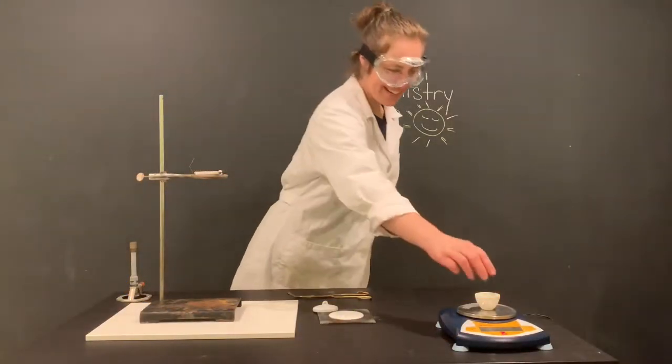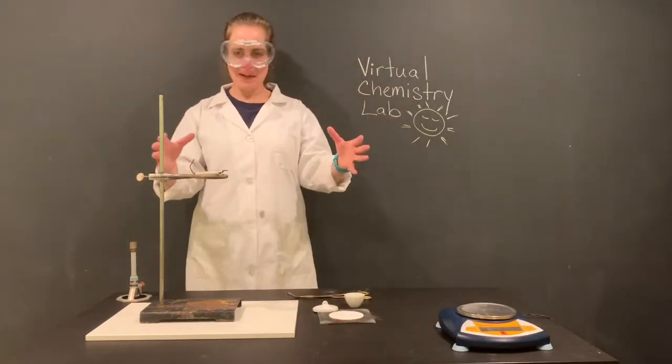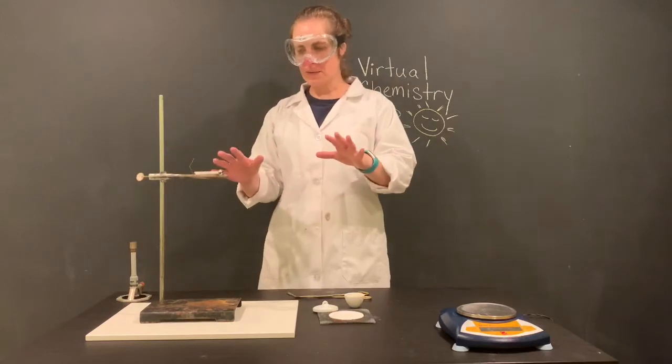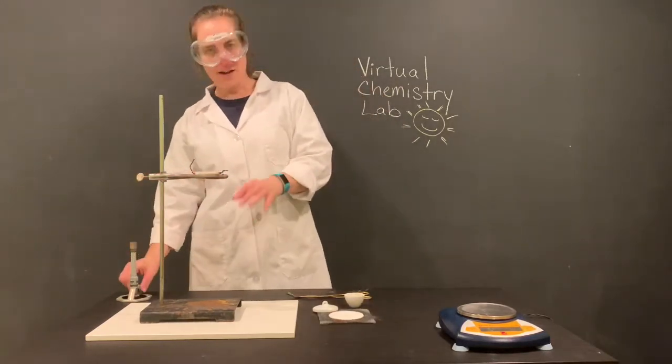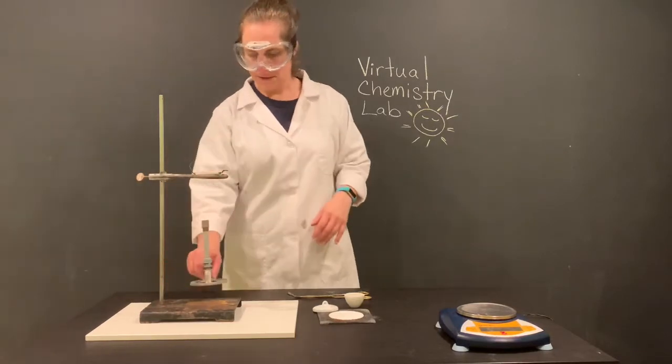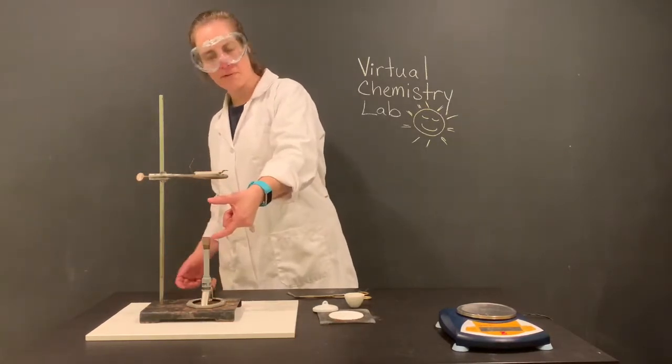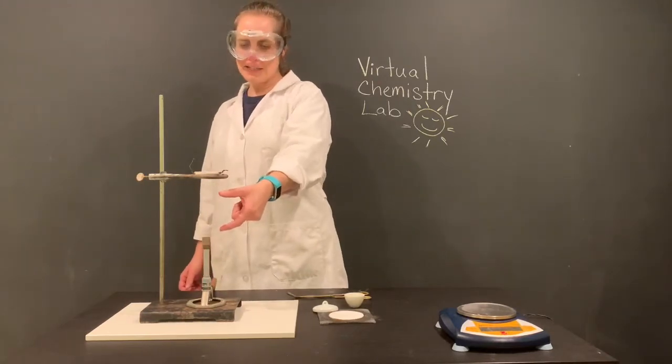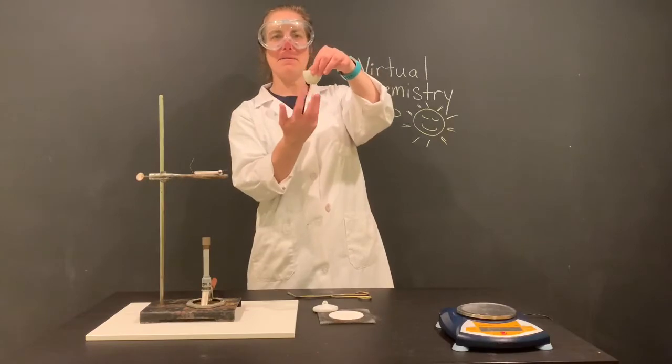Now we're going to go ahead and start our setup here. So the first thing we want to do is we want to make sure that our ring is going to be not too high away from our Bunsen burner. So we're going to want a decent-sized flame, probably about a few inches there, but we don't want it to be so high.